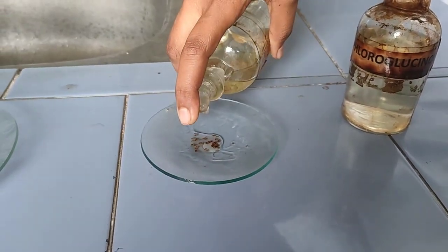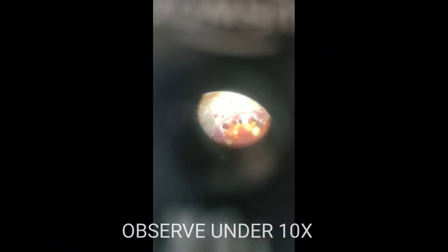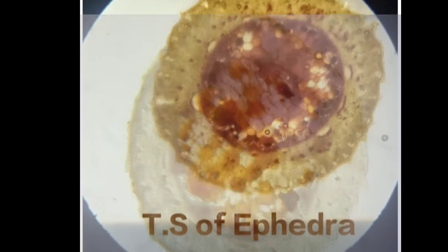Among the samples, select a good thin section and place it on a slide and add a drop of glycerin. Observe under 10x. These are some of the images of the transverse section of the ephedra stem.